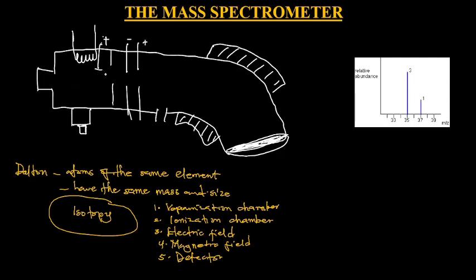Now this setup is like a tube. The first thing to do is to pump air out of this to create a vacuum, so we can say that this is a vacuum pump. Once we remove anything that is not needed out of this tube, we can focus on our sample, which may be a piece of solid or liquid.